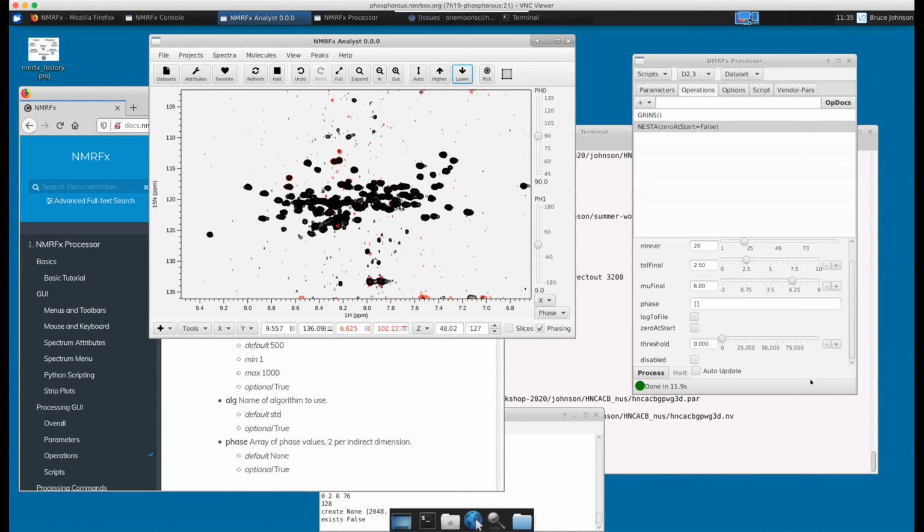But the point is, you can process a 3D like this in 10 seconds or so. So you actually can play around and see. But my thing is at least, okay, let's say we start, so comparatively, I can compare the two results of the two different processing algorithms.